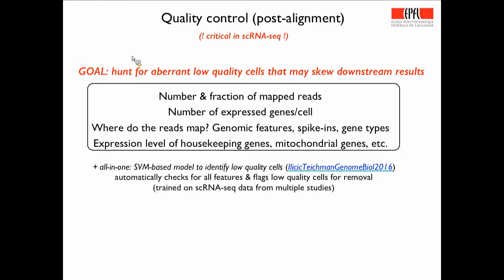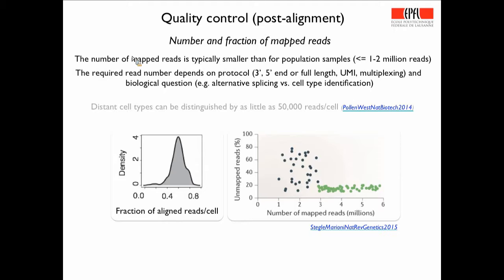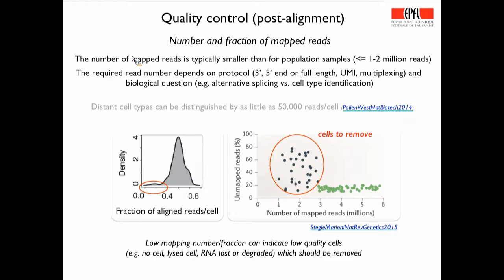Similarly, if you spike in a known amount of mRNA and see that most reads map to your spike-ins, your endogenous mRNAs were likely absent or very low quality — a disproportional amount of reads mapping to spike-ins is a reason to eliminate that cell. You can also use expression levels of housekeeping genes — if suspiciously low, you want to eliminate the cell. The Titan group developed a vector machine-based approach to automatically check for all these features and flag low-quality cells. This approach was trained on a lot of single-cell RNA-seq data from multiple studies.